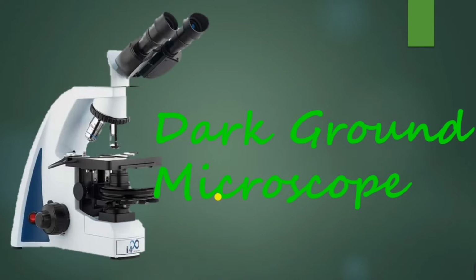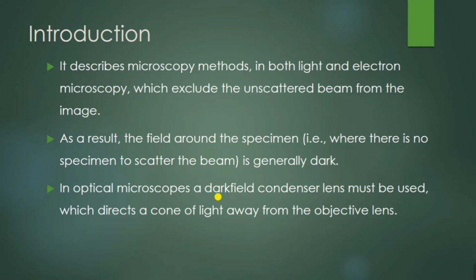Today we will be discussing a dark ground microscope. In this type of microscopy, they describe both light as well as electron microscopy. So dark field microscopy can be employed in both light microscopic techniques and also in electron microscopic techniques, which exclude the unscattered beam from the image. So a dark ground microscope will exclude the unscattered beam from the image.